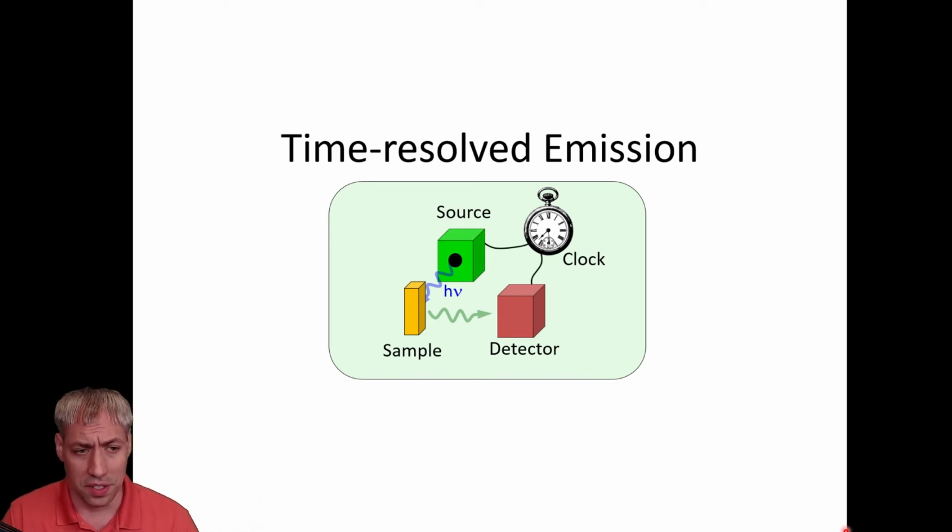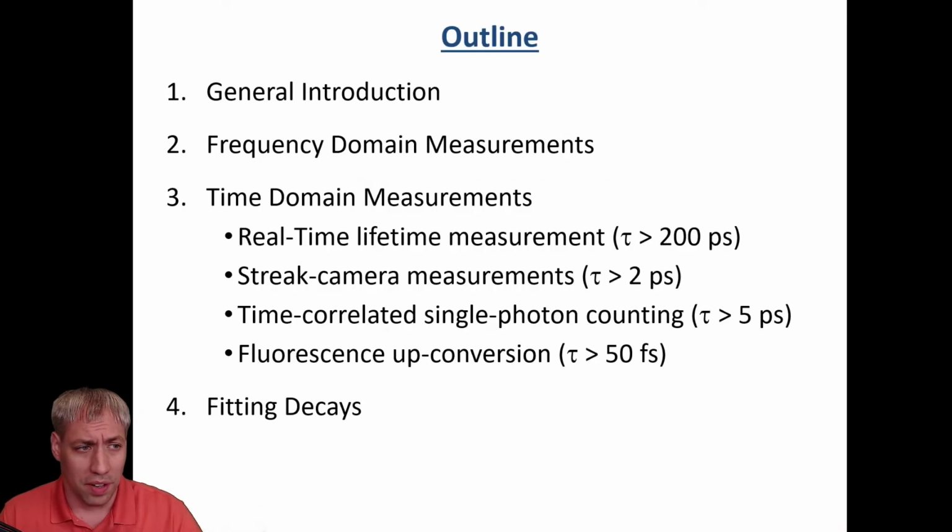I'm an associate professor in the Department of Chemistry and Biochemistry at Florida State University, and here's my lecture on time-resolved emission spectroscopy. And so just a brief outline of what we'll be going through: just a general introduction into excited state dynamics of molecules and materials, and then we'll go into logistics of measurements by both frequency domain and time domain. We'll just briefly cover frequency domain, primarily focus on time domain measurements, and partition them by complexity of the measurement or the time scale of those various measurements, and then finally close with a brief mention about fitting those emission decays.